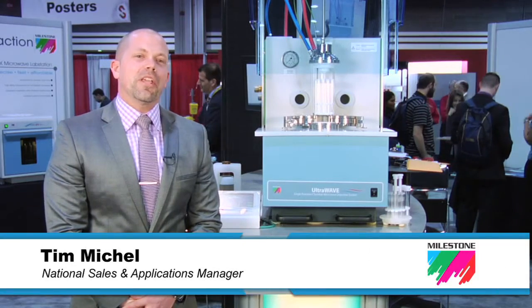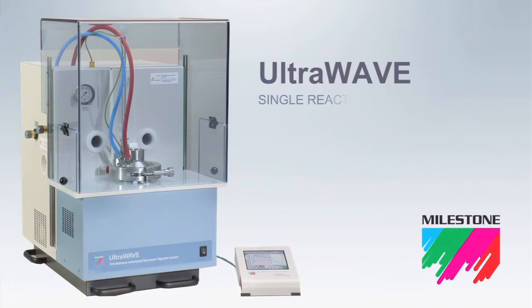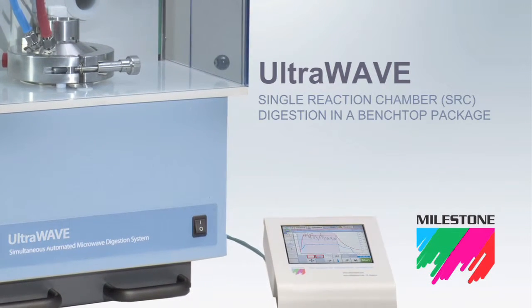Hi, my name is Tim Michael. I'm the Sales and Applications Manager for Milestone Inc. This is Milestone's new Ultrawave microwave digestion system, utilizing single reaction chamber, or SRC, technology.